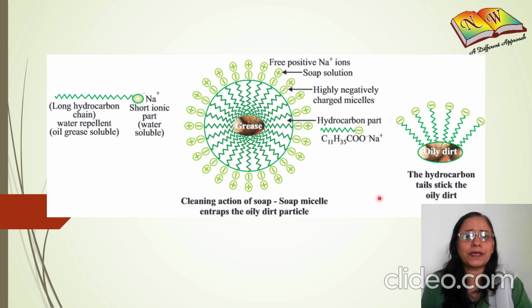But the action of soap is different in different kinds of water. When we use soft water, the soap is 100% effective, forming a rich lather which helps in cleaning the cloth very effectively. But when we use the soap in hard water, the effect will not be that prominent, because in case of hard water, the salts of calcium and magnesium that are present in the water react with the soap molecules, forming scum. Let us see this experimentally now.